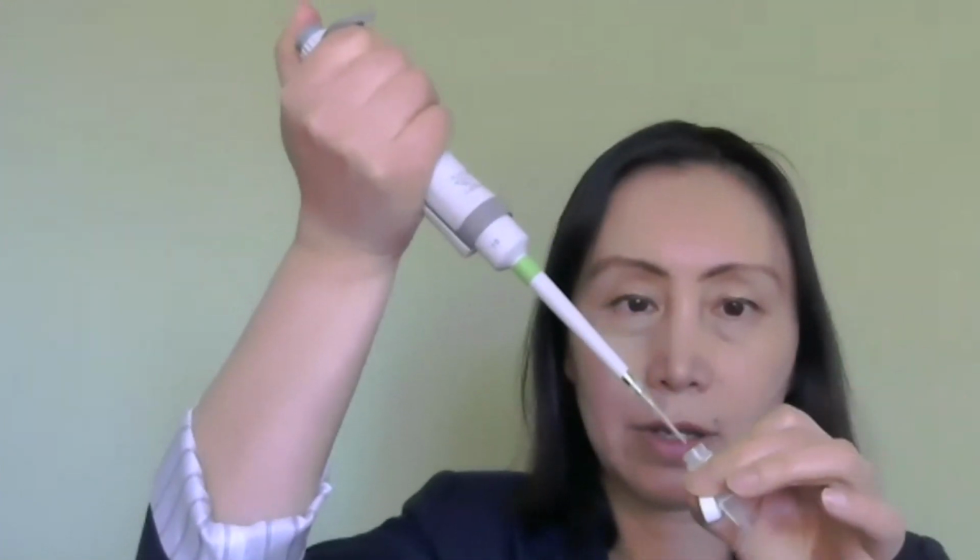So I will get this tip and open up the tube. Press down to the first stop, get into the enzyme tube and come out with 1 microliter of enzyme.